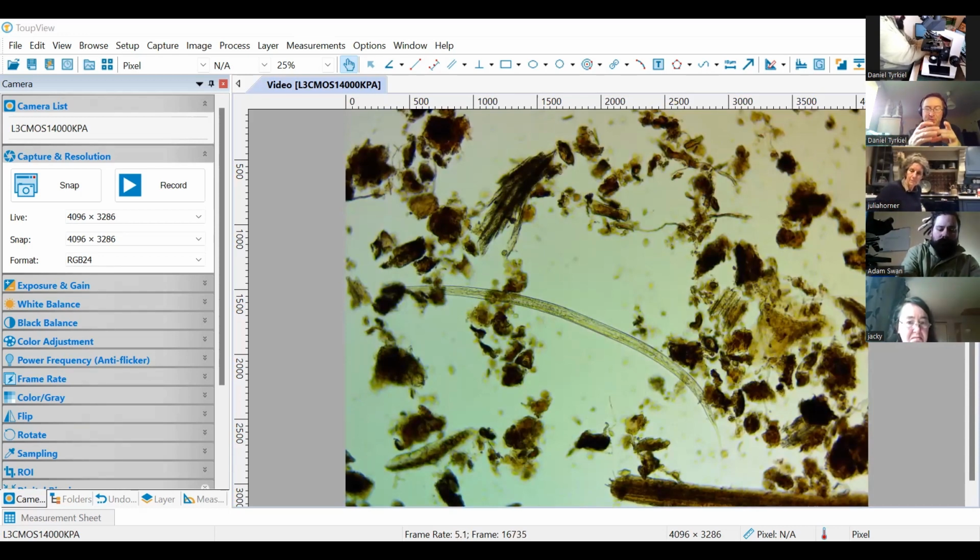You fill a petri dish, and you have a grid, and you count as many as you can on the largest grid possible. And they're very concentrated. If you can count all of them, then you have the best results statistically when it comes to nematodes, and you really have the best data.